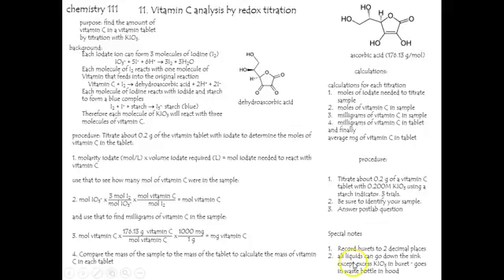Okay, so not many special notes here. Safety is not particularly dangerous, just a little bit of vitamin C, a little bit of iodate, and record your burettes precisely, your volumes that is. All the liquids can go down the sink except the iodate that's in the burette. That goes in a waste bottle in the hood.